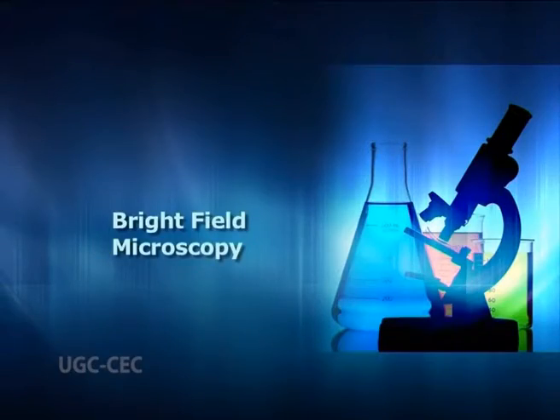Let us discuss an introductory idea about these basic types. Bright field microscopy. This is the commonly used or routine microscope. In bright field microscopy, the field of view is brightly lit so that organisms and other structures are visible against it because of their different densities. It is mainly used in stain preparations. Differential staining may be used depending on the properties of different structures and organisms. This may be a simple or a compound microscope.